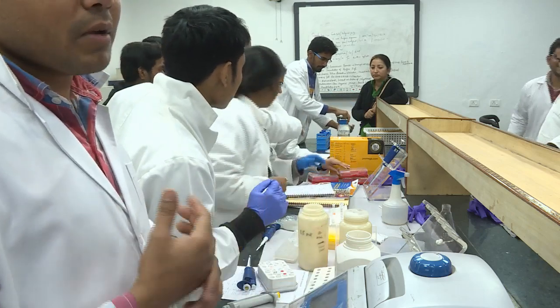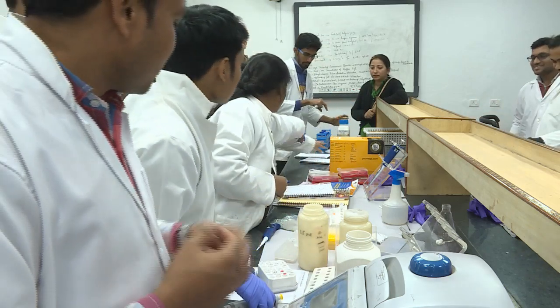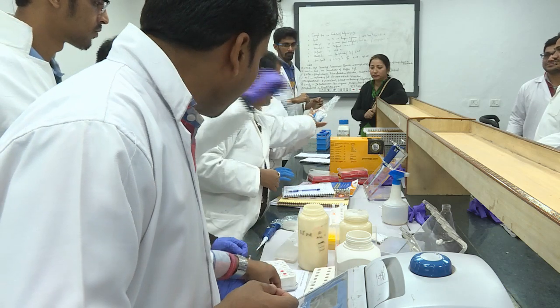So where is the primer? You can set it again. Ralstonia में कौन सा primer?